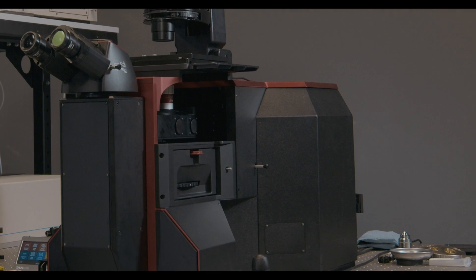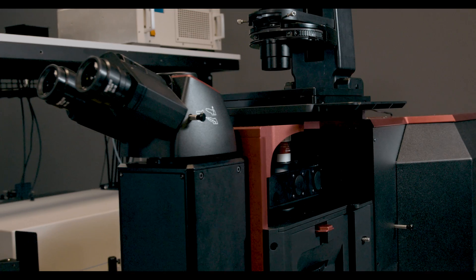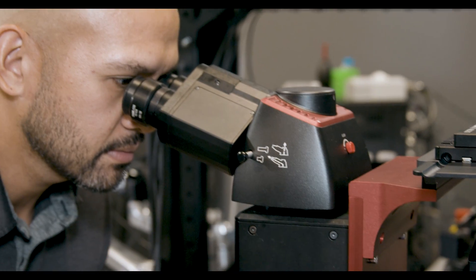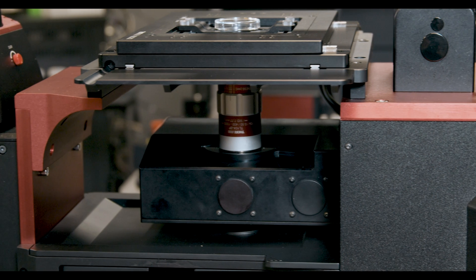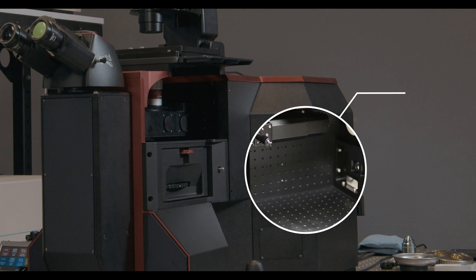The Veneto microscope features an integrated piezo that, unlike other solutions, is fully integrated into the frame. That means you're no longer trying to attach this additional mechanism that occupies real estate and prevents you from getting your hands in to manipulate your samples. The frame of the Veneto is quite unique in the sense that there's actually a breadboard built right into the frame of the microscope.